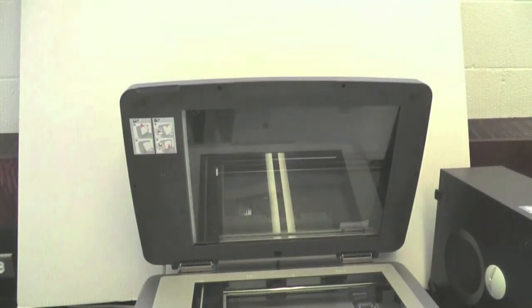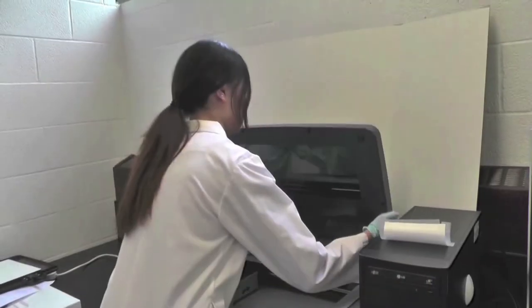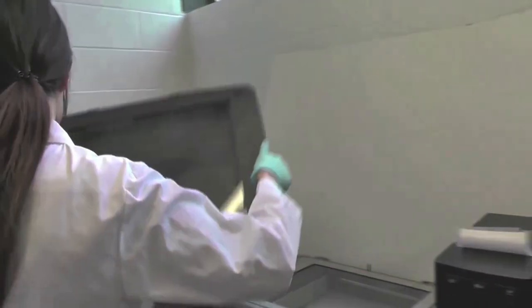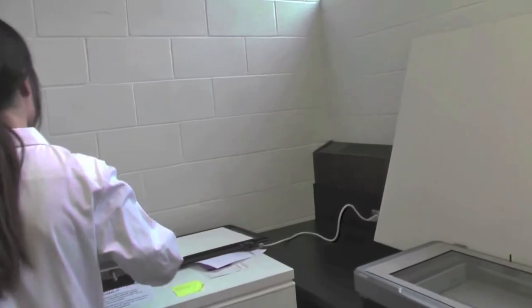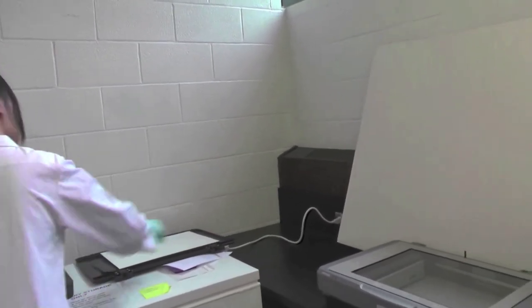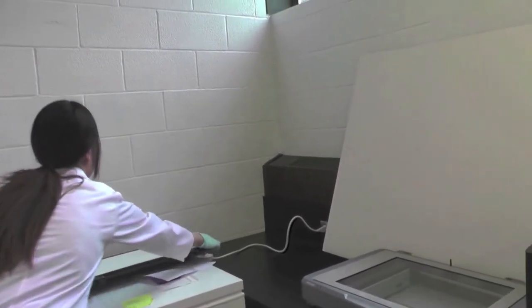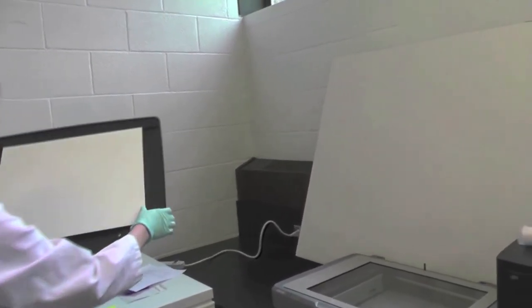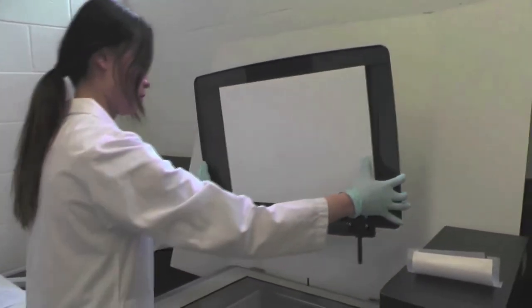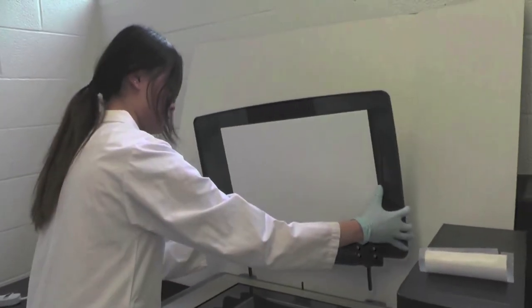This video will show you how to operate the densitometer. When using the densitometer, make sure to fit the scanner with the lid that has a white background instead of the lid that has a glass background. This will ensure a clearer image of the gel.